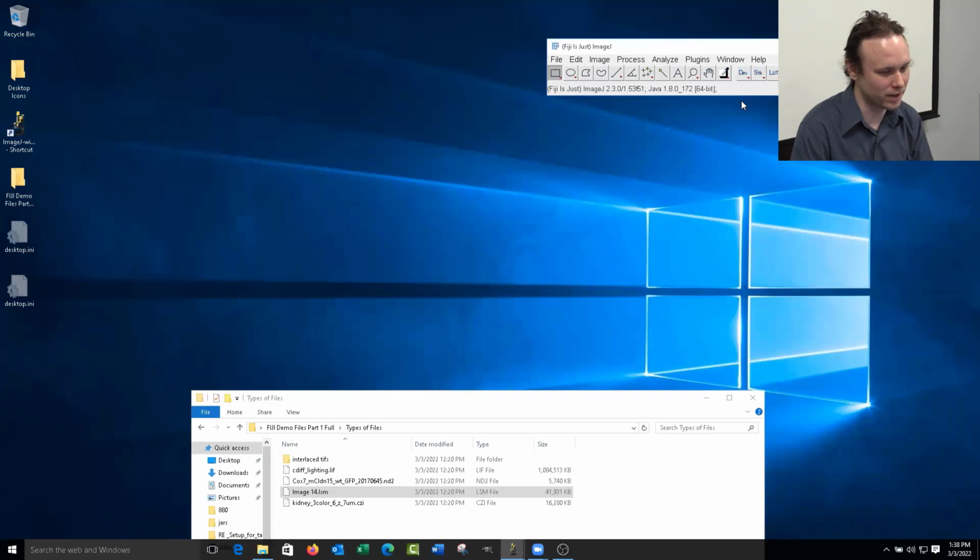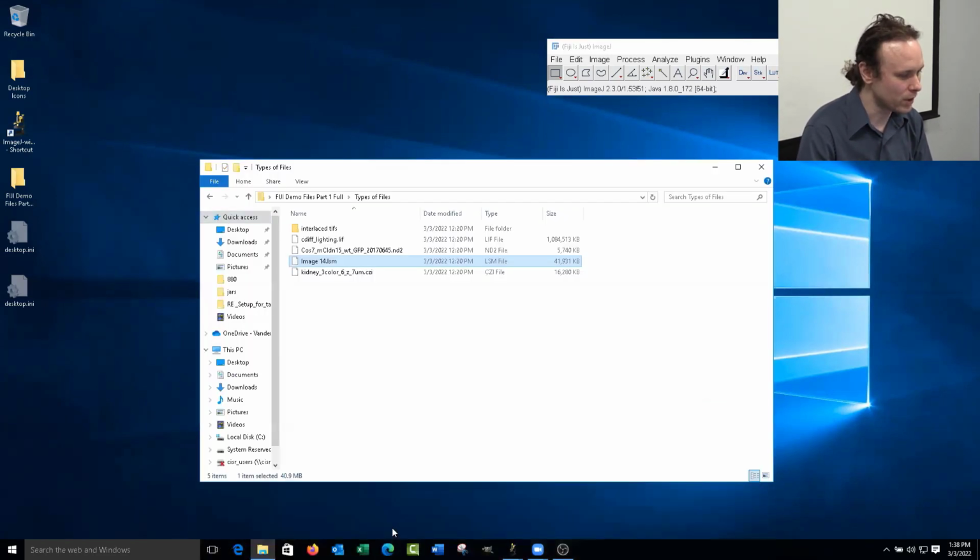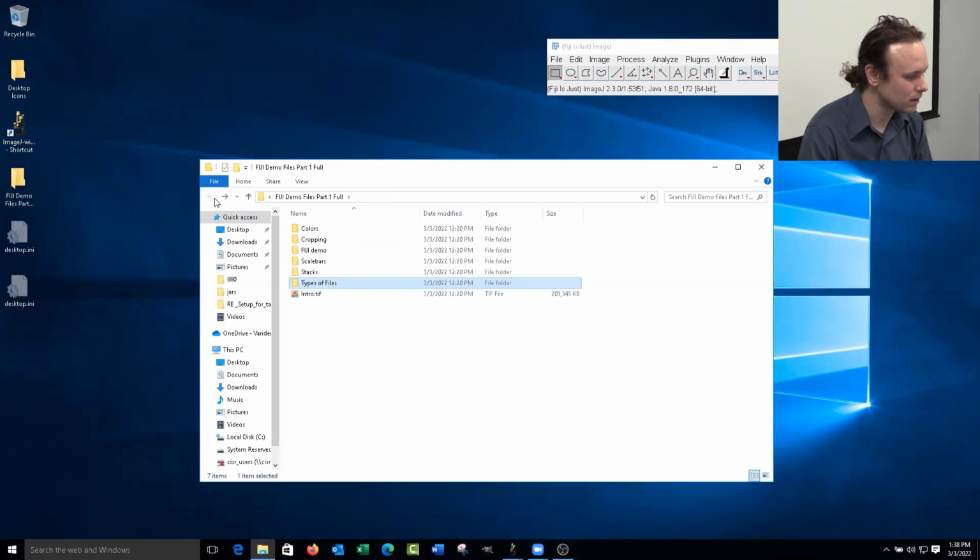You'll find if you ever get data analysis from me that it will have a -1 after it. That means duplicate. It'd basically be your image plus dash and then a number. Usually 1, but if it's duplicated more than once, it might be a bigger number. Okay, let's do some scaling.